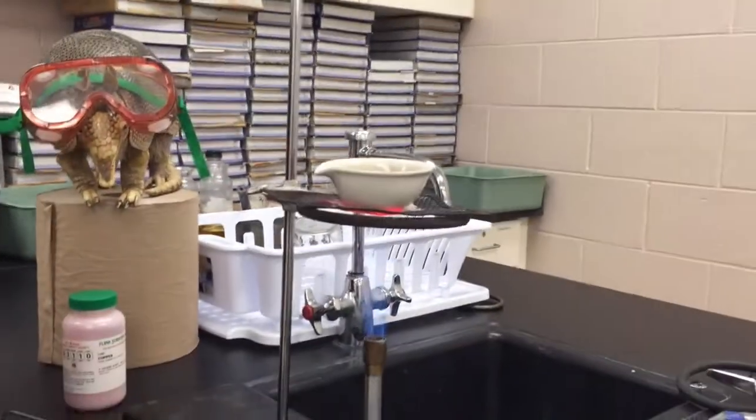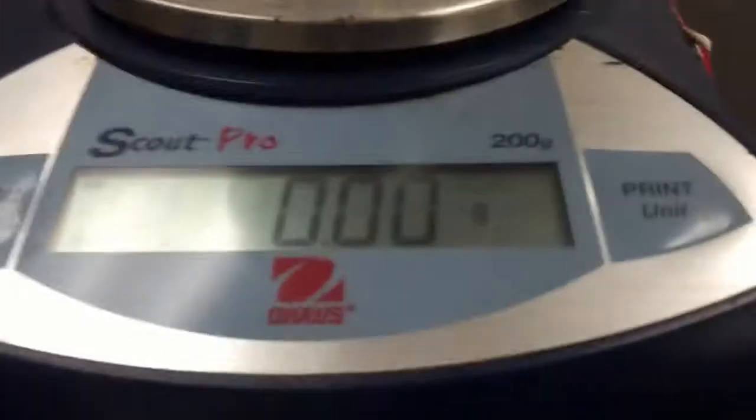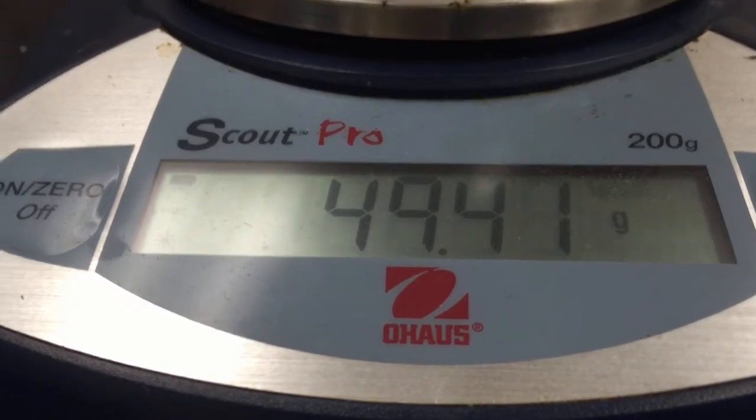I'm going to get another mass and see if it has changed. It was 49.37 last time. It is going up to 49.41. So it went down for a bit. Peculiar. And now it's gone back up. I wonder if I can trust the scale. All of these thoughts are going through my mind as I think about this.